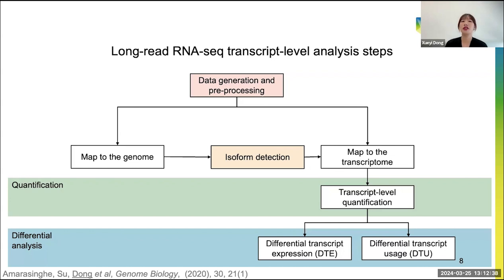Then with the reads mapped to the transcriptome, we can perform transcript level quantification. And with the count matrix at the transcript level, we can do differential analysis, like differential transcript expression analysis, DTE analysis, or differential transcript usage analysis, DTU analysis, to study differential splicing.